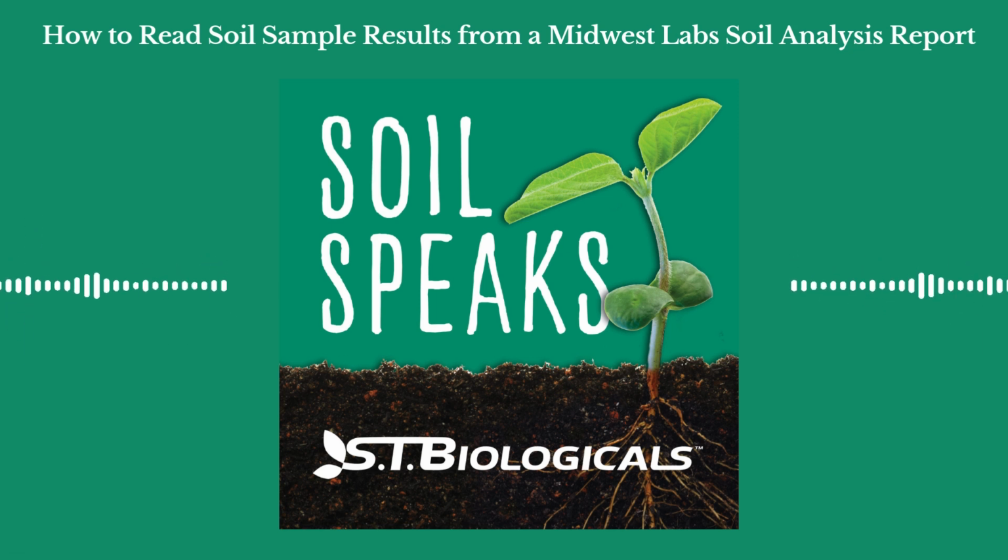Midwest Labs soil test metric number 1, cation exchange capacity, or CEC. The first metric on a Midwest Labs DTPA test is the CEC, the cation exchange capacity. CEC measures the soil's ability to retain essential nutrients for plant health. It measures the positively charged cations, such as calcium, magnesium, potassium, and ammonium.